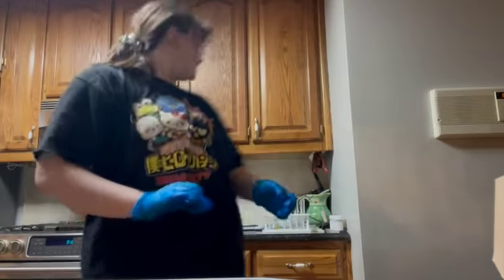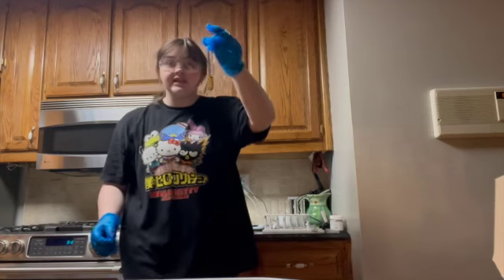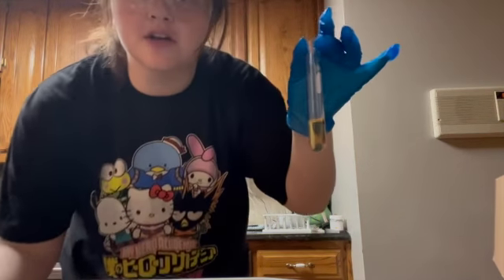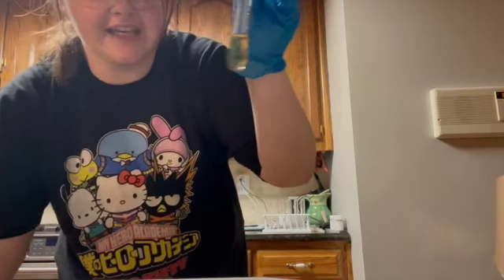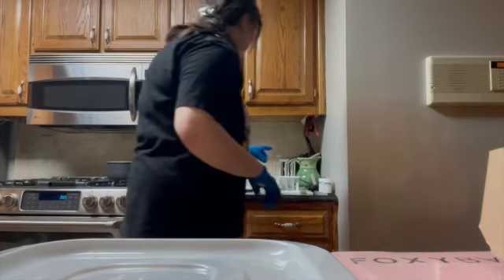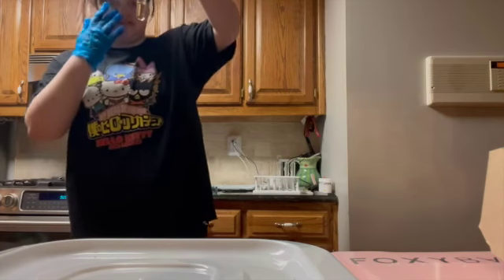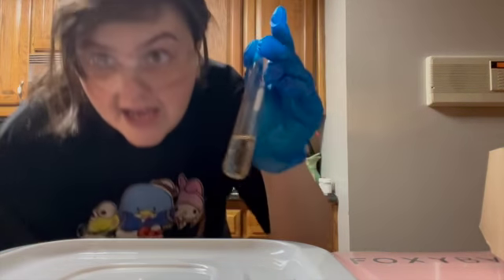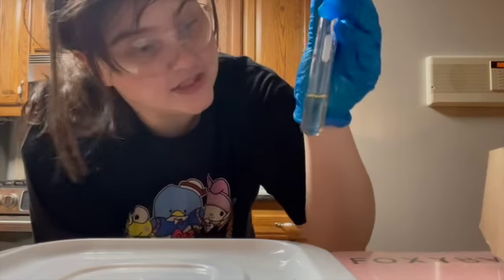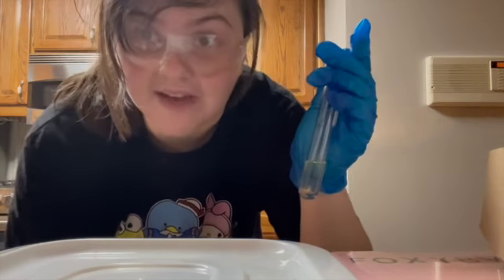So we've reached now 18.5 minutes, and as you can see, our solution has turned from the orange that was stated earlier into this light yellow, and so we'll see what happens in another few minutes. Okay, so we're close to 28 minutes with this solution, and it is getting pretty clear. It still has this yellow hue to it, but not as yellow as it was the last time that I showed it. It's getting pretty clear, so hopefully in a matter of a few minutes we can see how fast this changes.